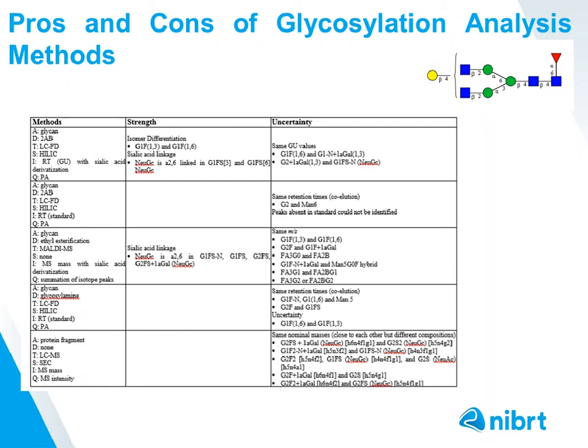And if you imagine an HPLC chromatogram and you're integrating a peak and there's more than one glycan in that peak, it's very difficult to quantify exactly the abundance of one of the 2 species or one of the 3 species. So I would say in general, and this is just my personal take home, but in general, UPLC or HPLC based methods, where there might be a weakness is in the overlapping of some glycans within a peak, and therefore mass spectrometry would be better in some techniques when you think about that.